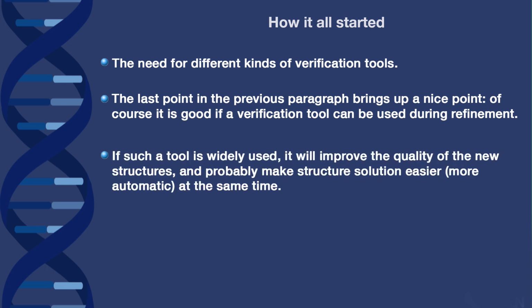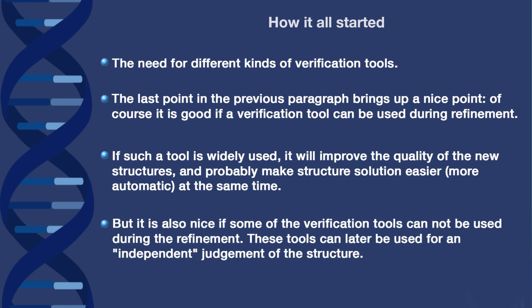If such a tool is widely used, it will improve the quality of the new structures and probably make structure solution easier. But it is also nice if some of the verification tools are not used during the refinement. These tools can later be used for an independent judgment of the structure. A number of such checks are part of WHAT IF. So, WHAT IF is a kind of protein structure verification tool.